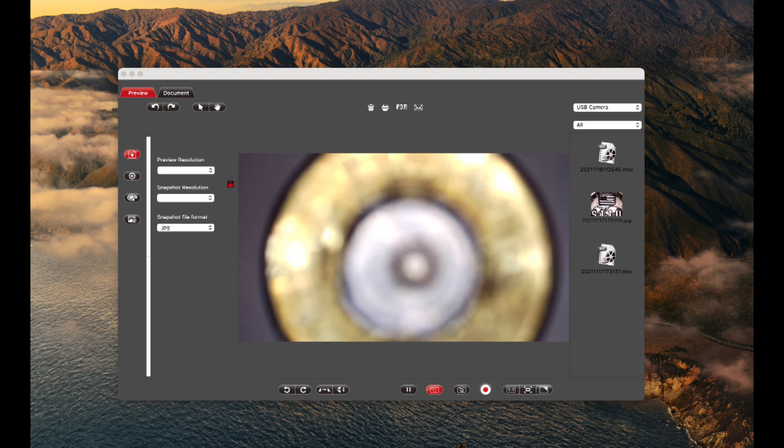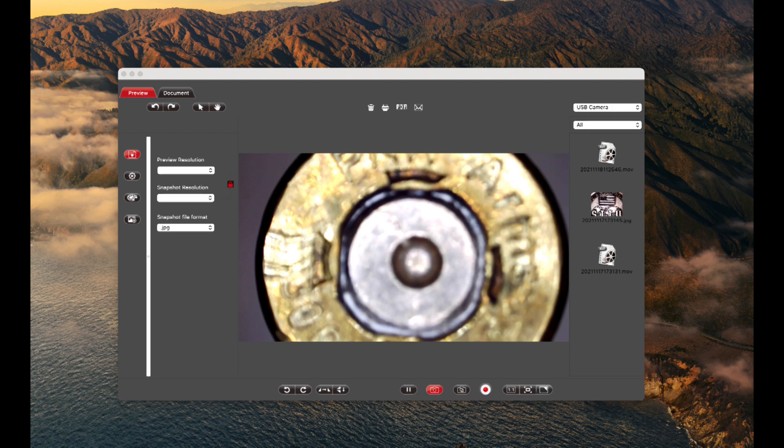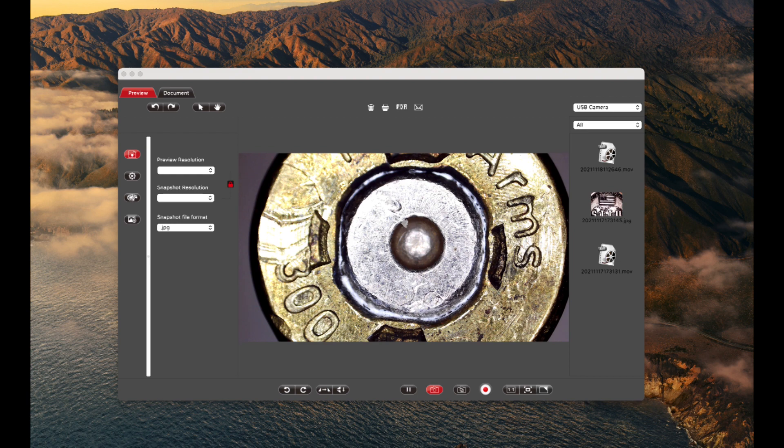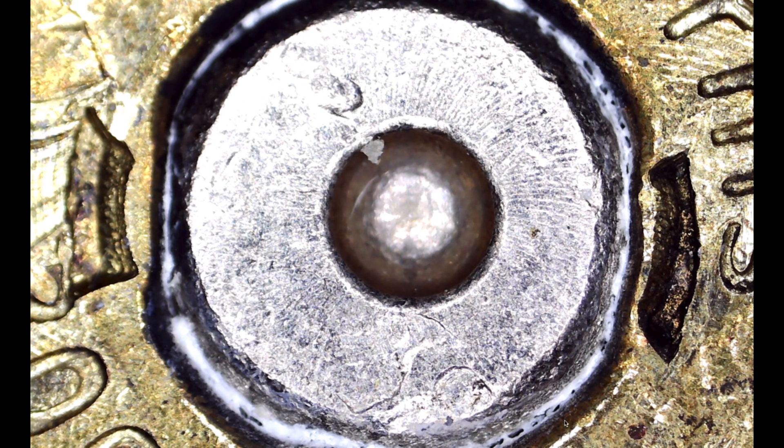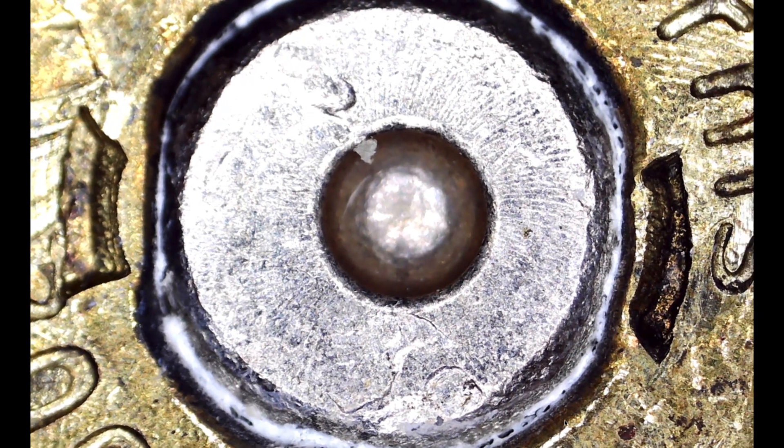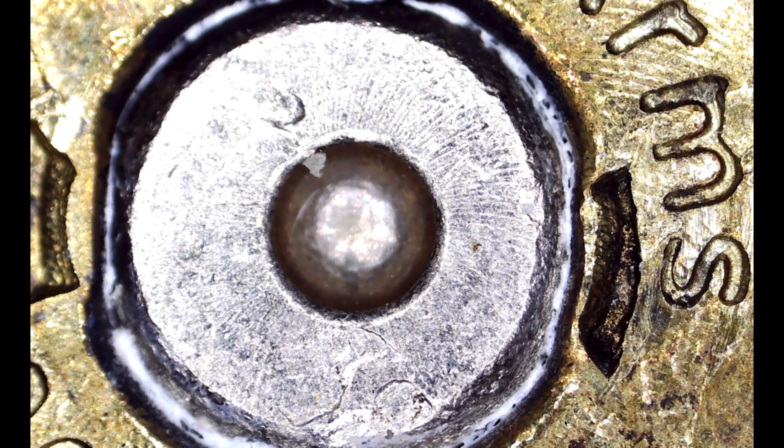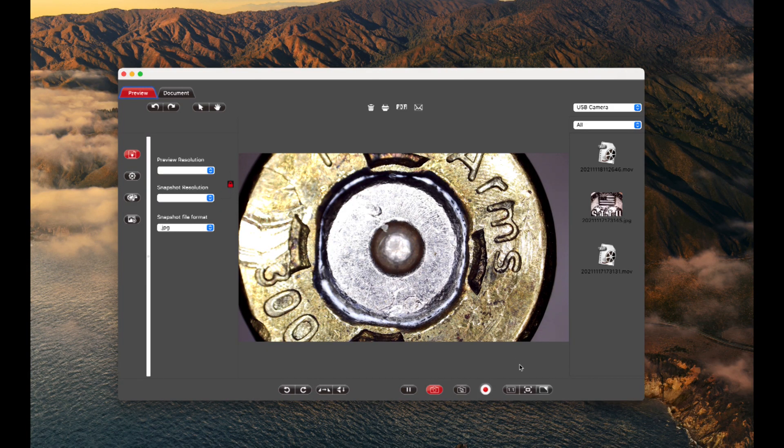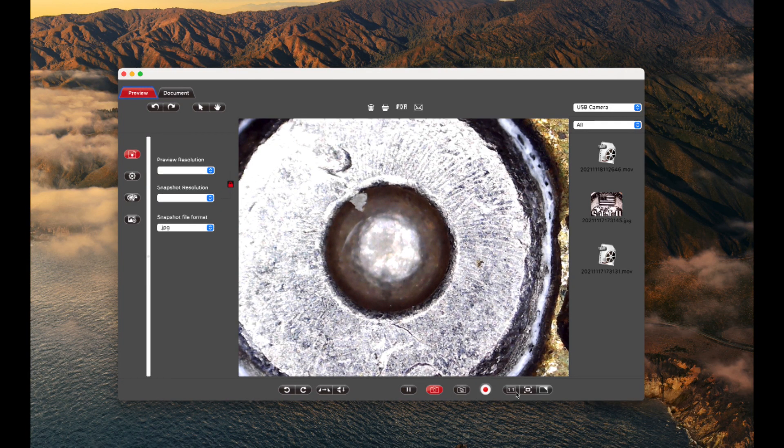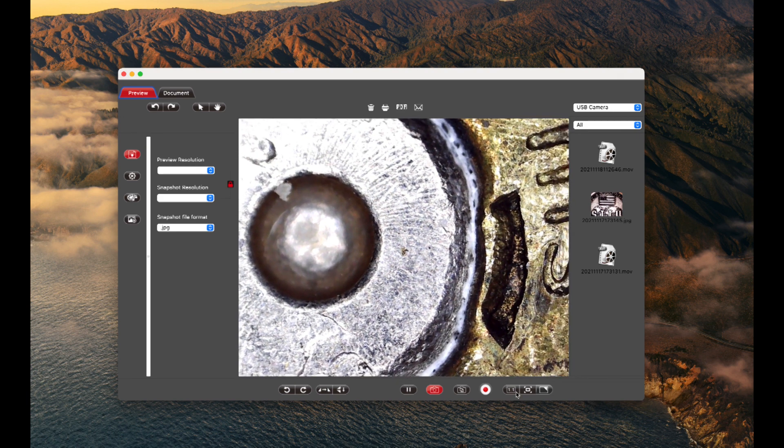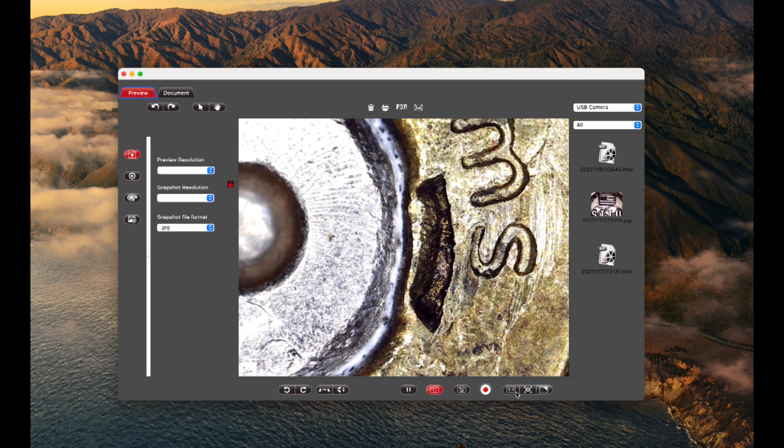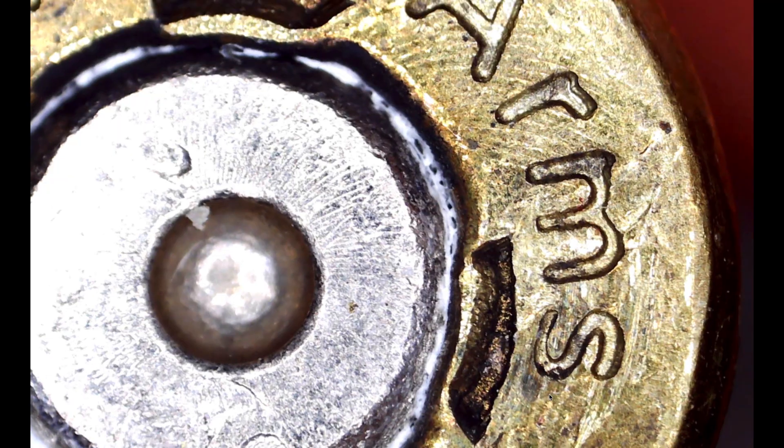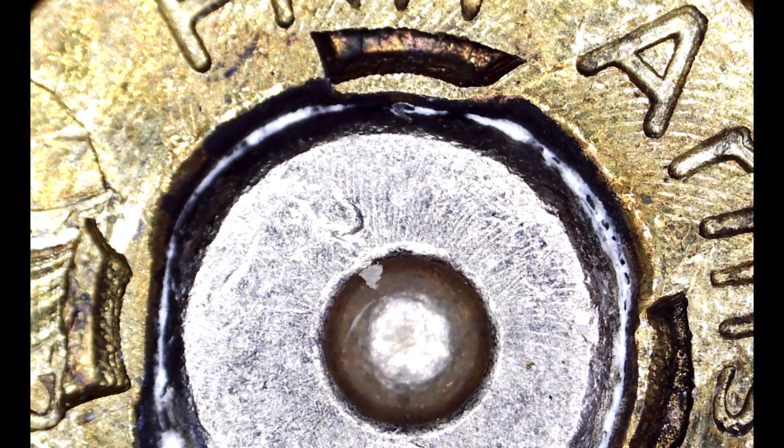Now we're going to focus in on the tail end. I just have the case stacked up on the table on the little base. That is the primer and the center circle is where it's been indented by the firing pin. You can see the crimp marks off to the side, how the brass is actually deformed crimping in to mechanically hold that primer into place. You can see the texture of the brass where it's been deformed upon firing.